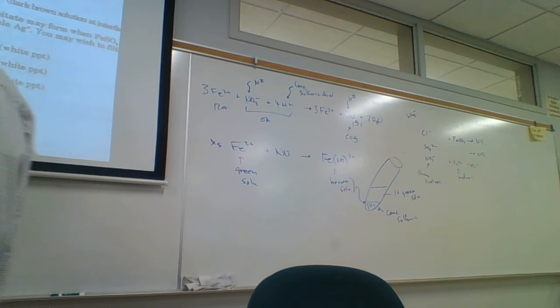All right, so those are all the reactions. So on the report sheet, 2 parts. 1, just a list of the cations you found, anions that you found. 2, write down all these reactions for the analysis.